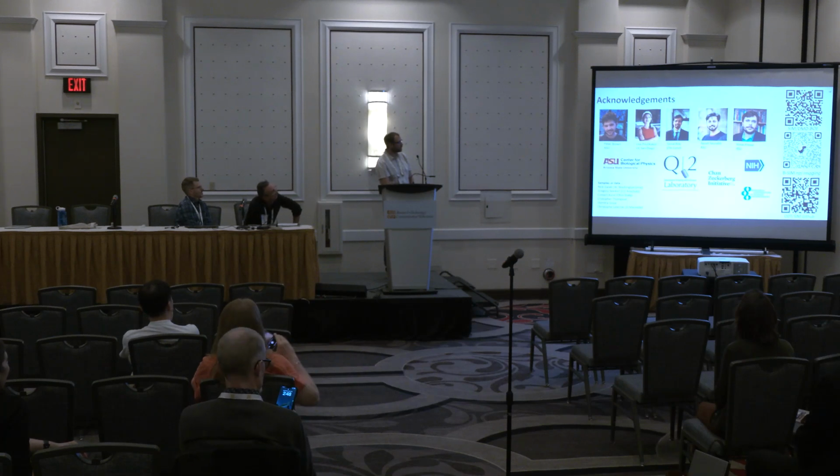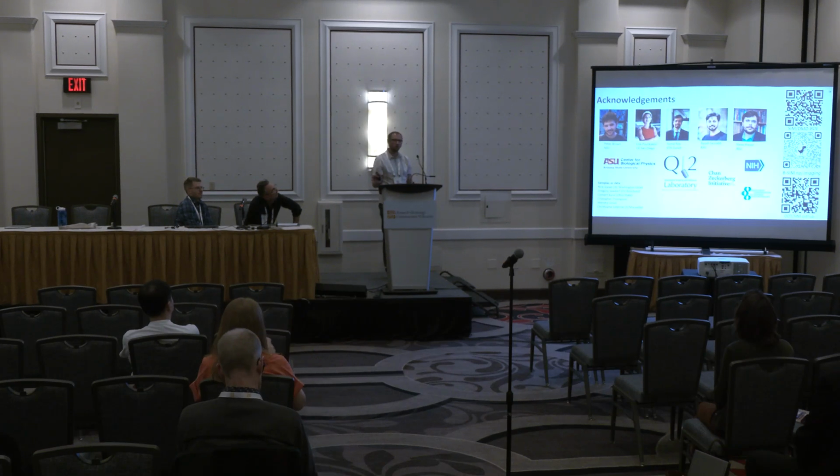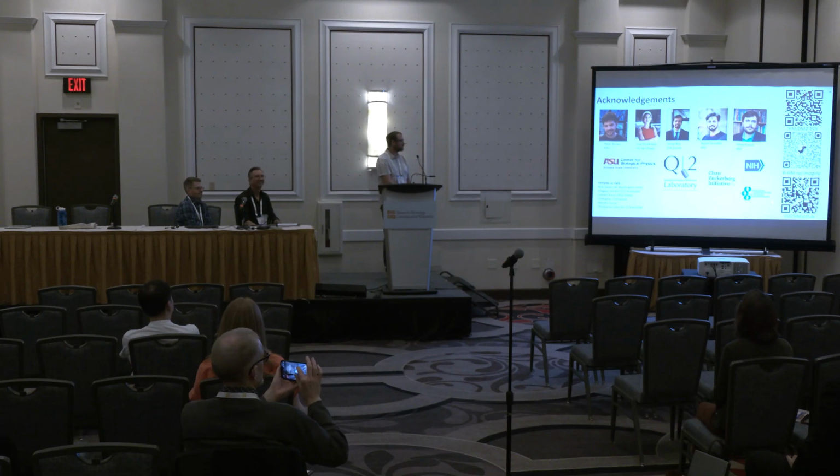And then we develop in the open, so we don't patent anything. Everything's on GitHub, all warts and everything. It's all free. We answer tons of people's questions. Lots of people have adapted the spatial light modulator code to get there.